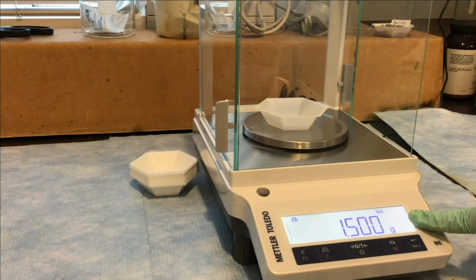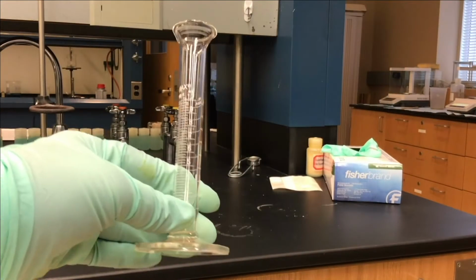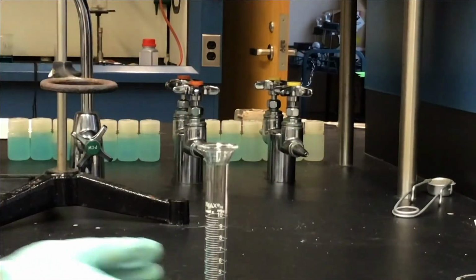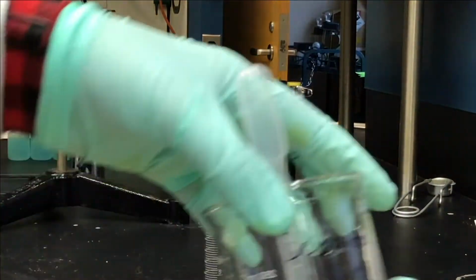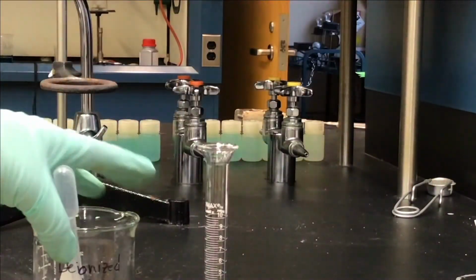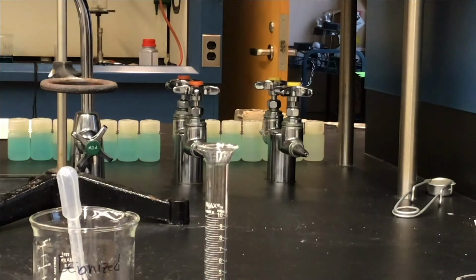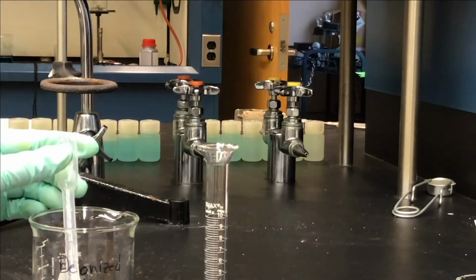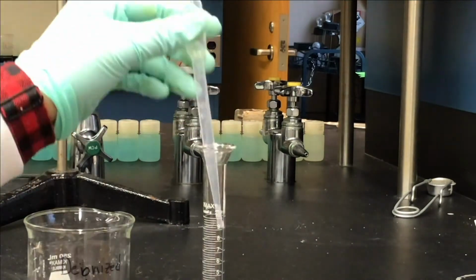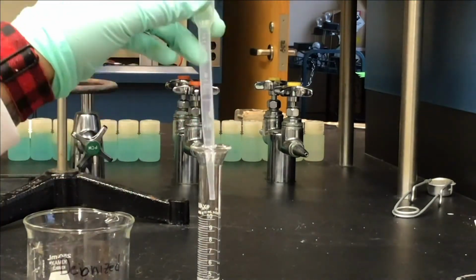Once we have 1.5 grams and we've recorded the mass, we're going to take a 10 milliliter graduated cylinder and fill halfway with deionized water. While adding the water, we're being very careful to not leave any water on the sides of the graduated cylinder so that our solid won't stick to the sides when we try to add.